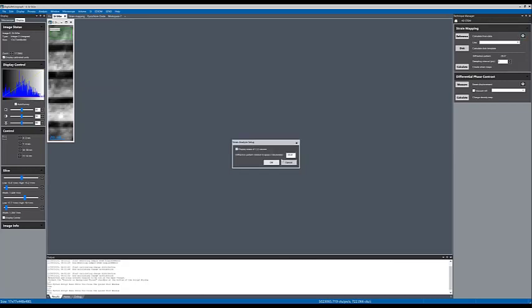Here, one important thing that I want to show you, and Roberto also referred to this during the microscope session, is that it is very important to know the calibrated angle between your diffraction pattern rotation and your scan rotation. So you want to know the growth direction corresponds to which reflection in your diffraction pattern and what is the angle between those.